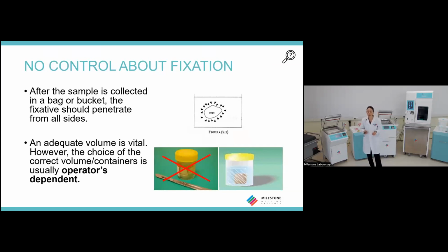Another important point, considering that this operation is operator dependent, the formalin level is not standard, and it's possible that one operator inserts the formalin and, we are human, the formalin loading in the plastic container is not enough. Then when the container arrives in the pathology lab, the first perception is, it's safe, it's in formalin. But then if you open the container, maybe you find that the formalin level is not enough.